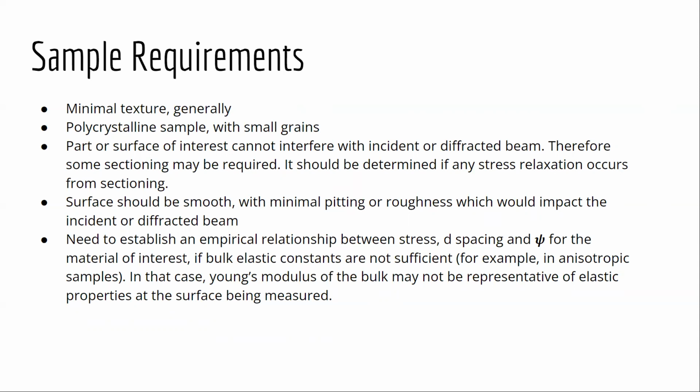And then in some cases, you'll need to establish an empirical relationship between stress, d-spacing, and psi for the material of interest. And sometimes you cannot assume that the elastic constants of the bulk are going to be representative of the surface where your measurements are being taken. So that's something else to consider.